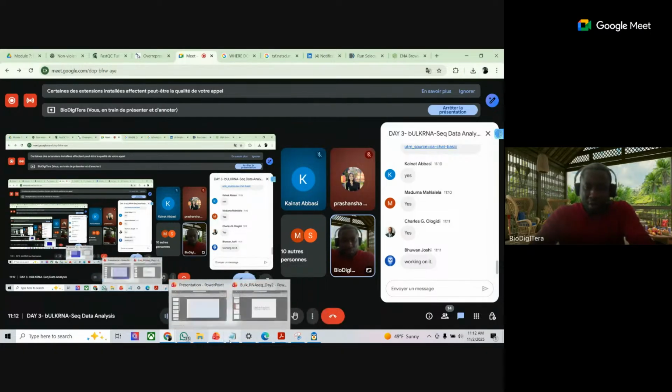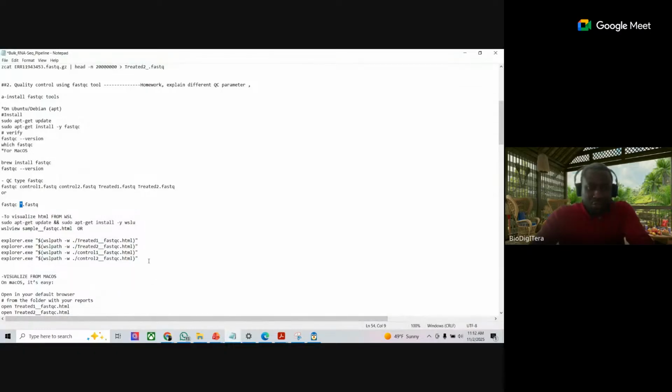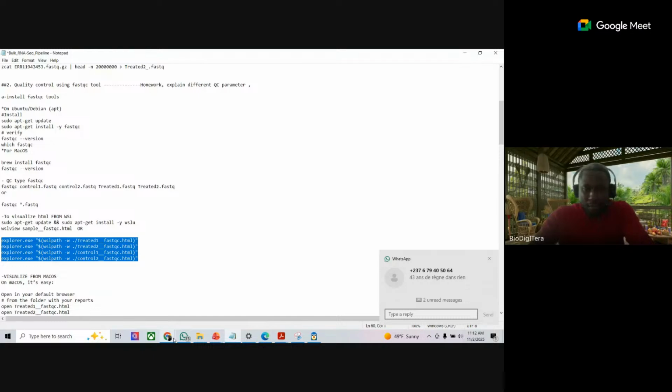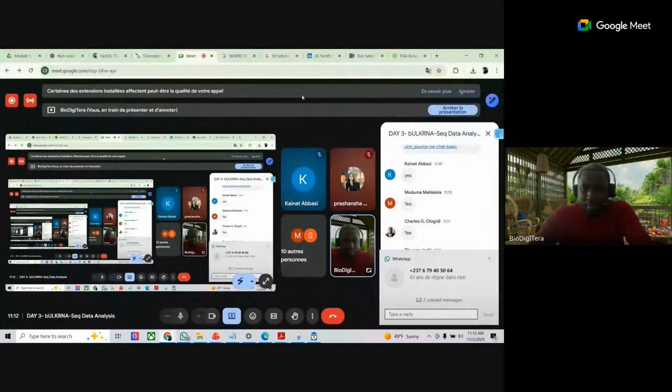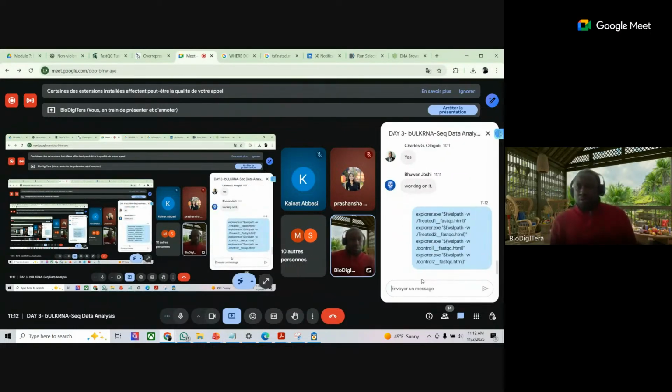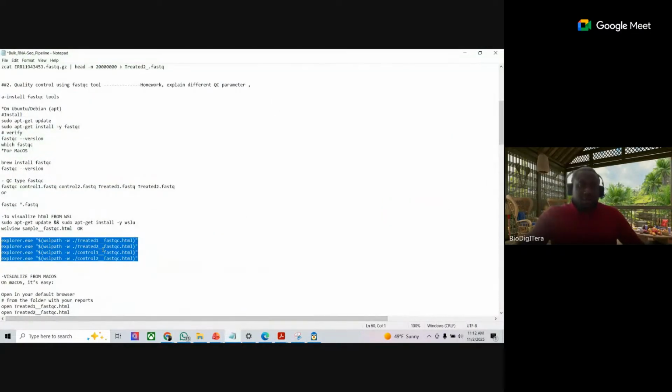For those who have already finished, I give you the command. Run this command. You don't have to change anything. Just run it like that. And what does it mean? Who can tell me what we are trying to do now? By intuition, can someone tell me, what are you observing?